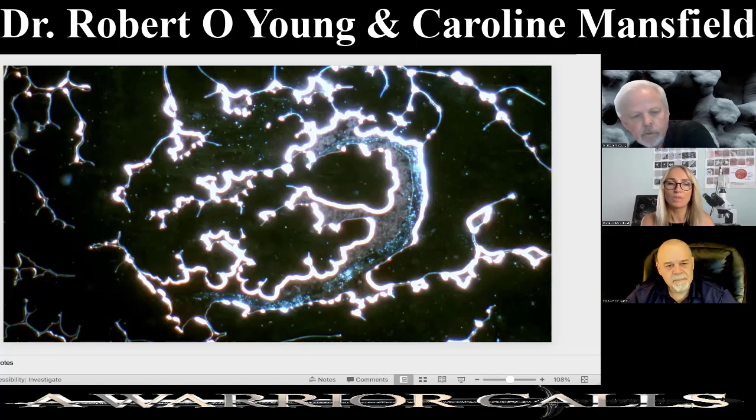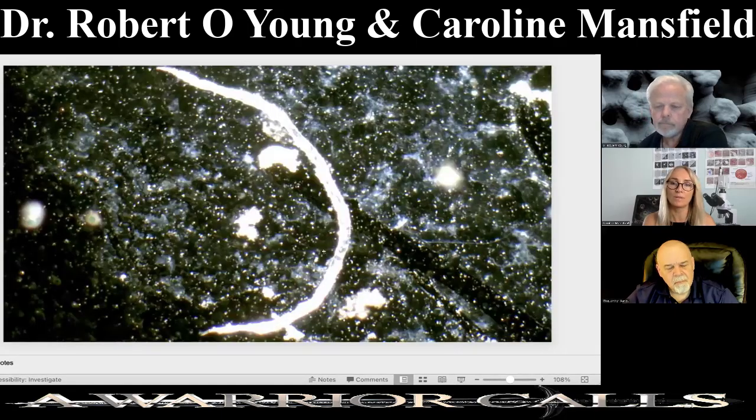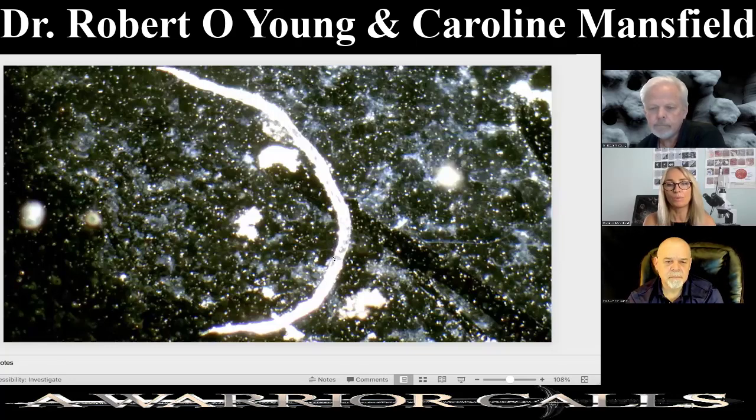I've been seeing these in just about everybody I look at over the last couple of years. It's quite familiar now. So I added the MasterPeace, as I said, and what I noticed was that the MasterPeace really attached onto the structure because we can see it light up, which, as I've explained, the crystals of the zeolite do. So if it does have elements of graphene in it, which is highly positively charged, then the zeolites would be grabbing hold of this structure. But there's nothing else building around it. The zeolites aren't doing anything else.